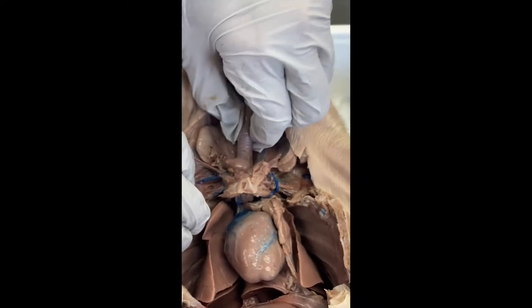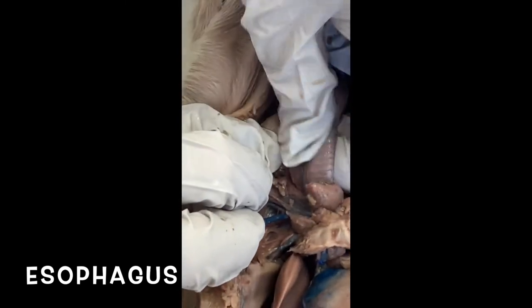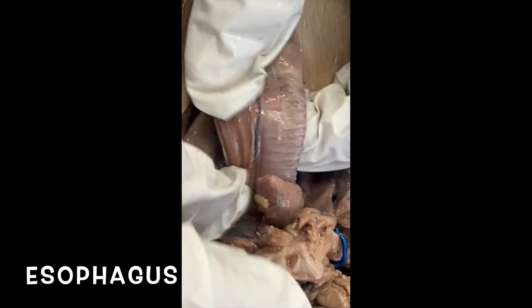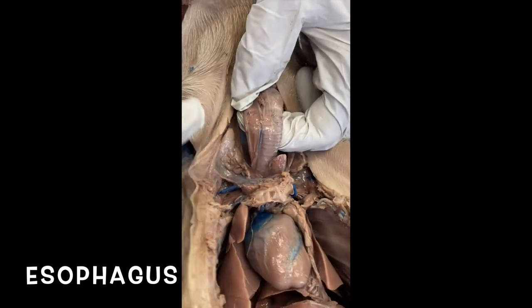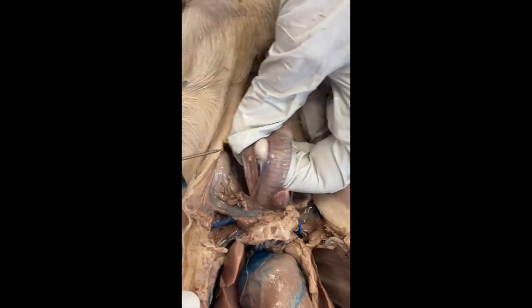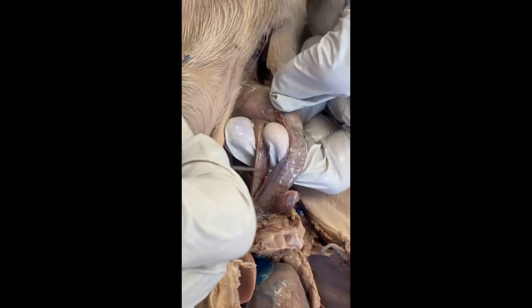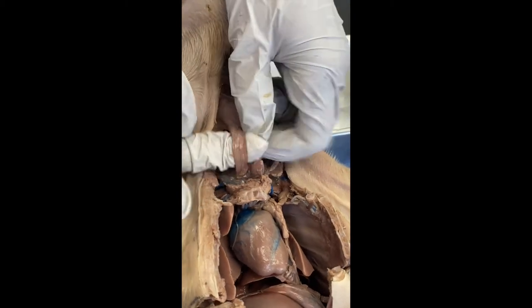Now, right behind it, which is why when you are eating something and get something stuck in your throat, you cough, because the esophagus is right there next to it. So if we look at the difference in these two tubes, your air is going to go down here in the trachea, and then I can put my finger between it, actually you can see the difference now. Trachea, and then the tube here is the esophagus, where it goes down into your stomach. And then I'll just hold the esophagus so you can see what that looks like.